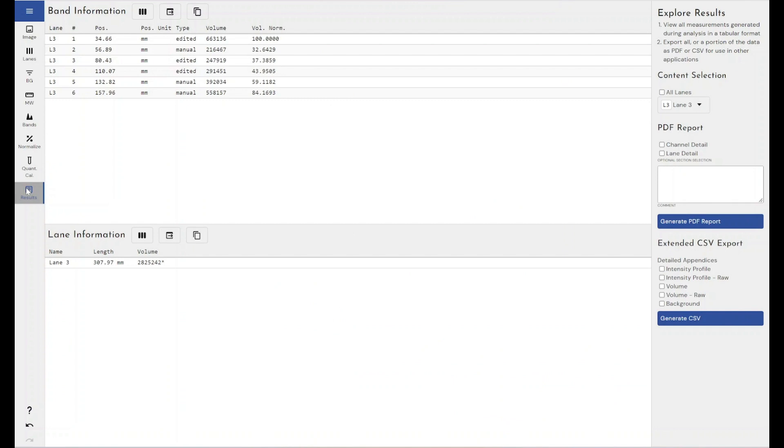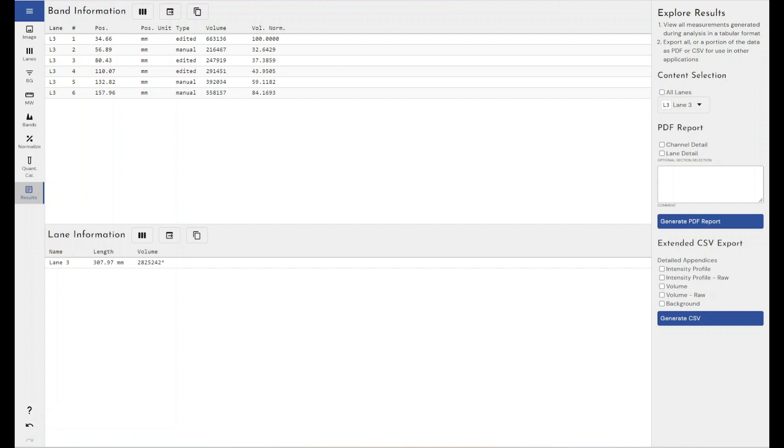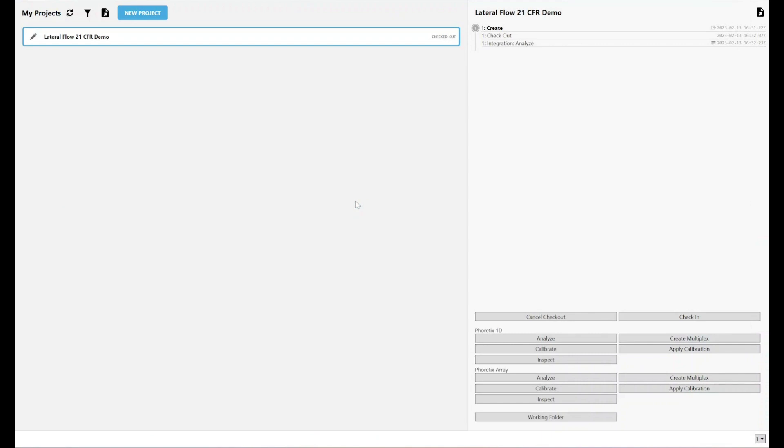As you can see, we can still generate our PDF reports from our experiment here, but we can also do that within our 21 CFR environment as well. So, I'm going to do it that way because I've already shown you how to do this in multiple videos about Phoretix 1D. I've got to the end of my analysis. I'm going to close down my project and I'm going to save it.